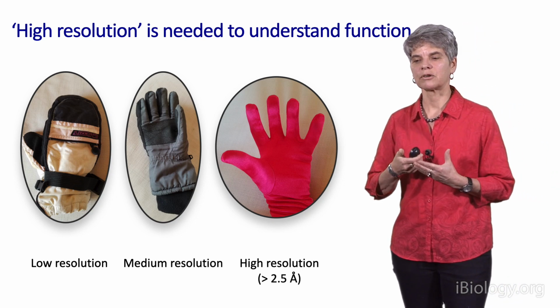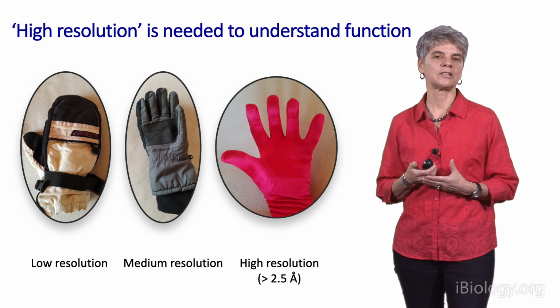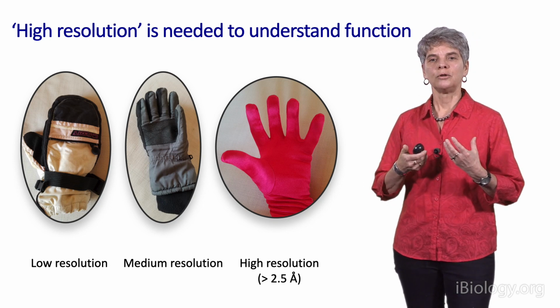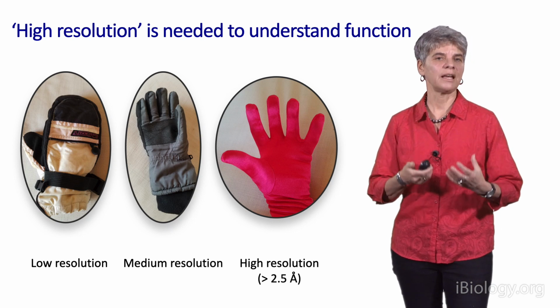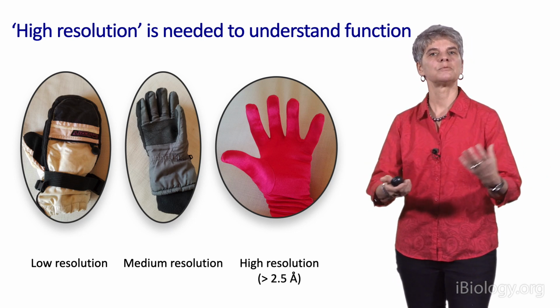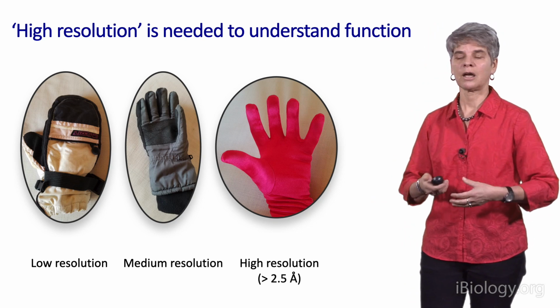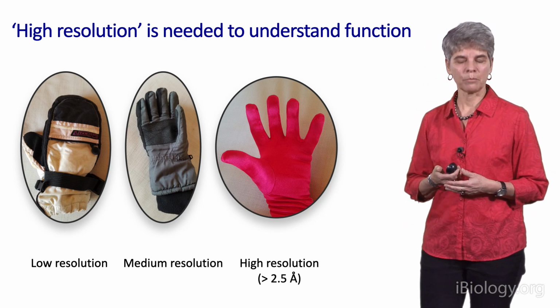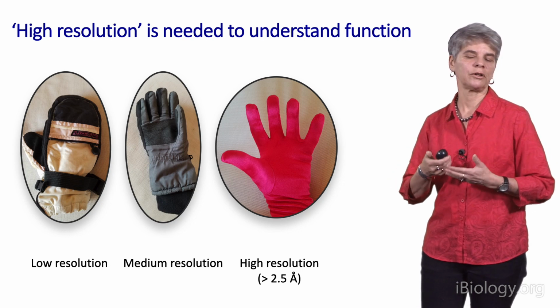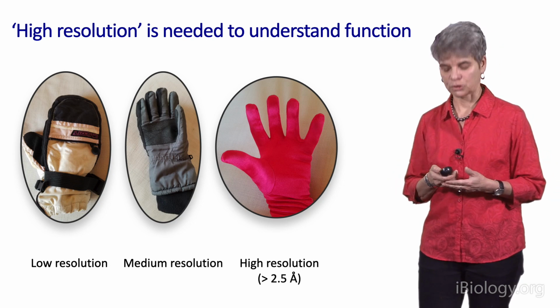And that's why crystallographers and other structural biologists always use orthogonal approaches to obtain different states of the molecule in question, so that we can interpolate between those different states to see how they get from here to there. And we also use additional methods to observe these machines and molecules in the act of doing their job.